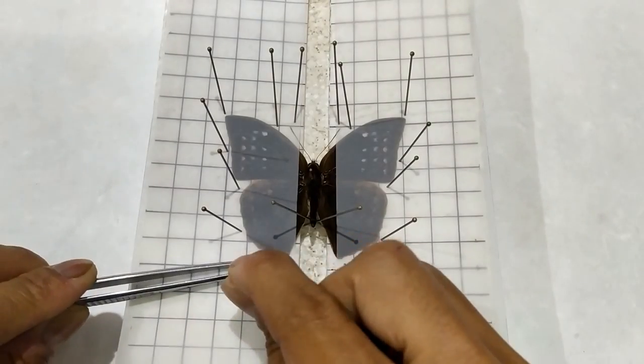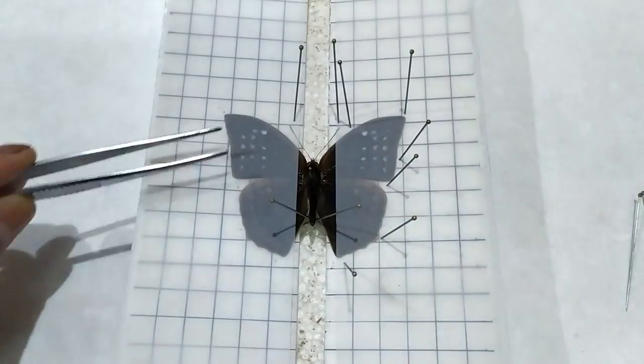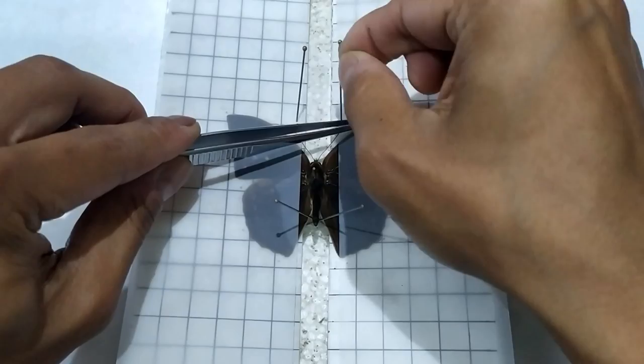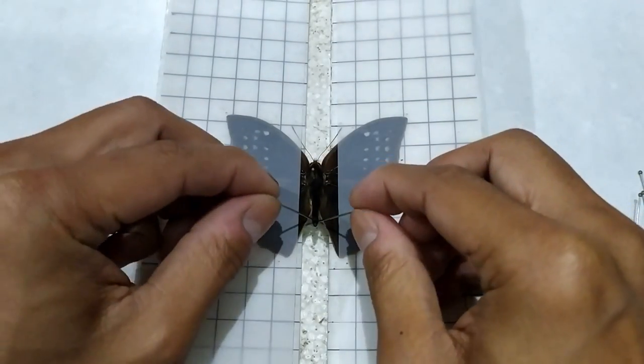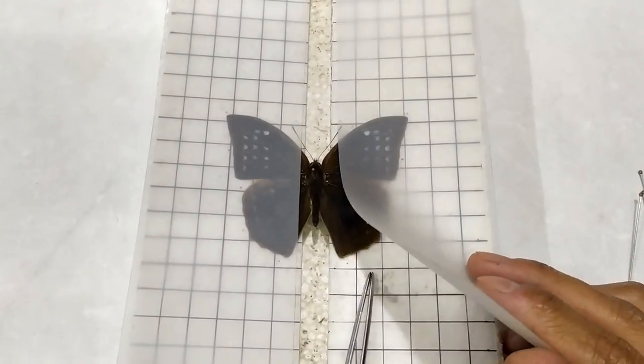Once the specimen has dried, carefully remove the pins used to secure the wings, abdomen, and antennae. Then remove the butter paper sheets from the wings.